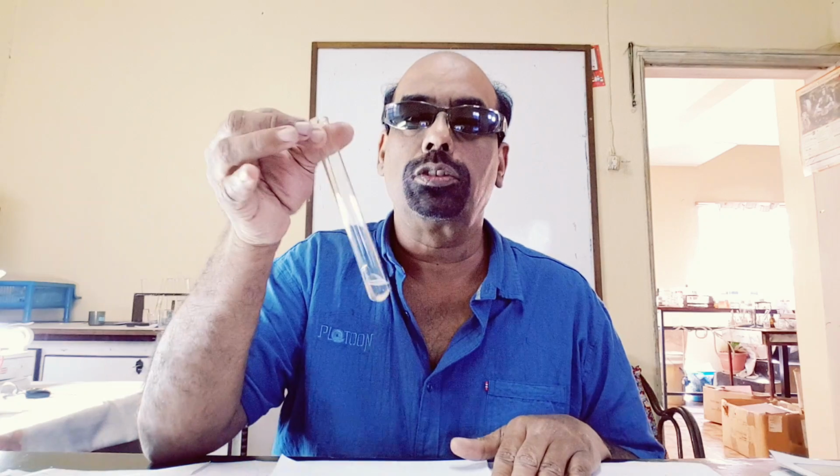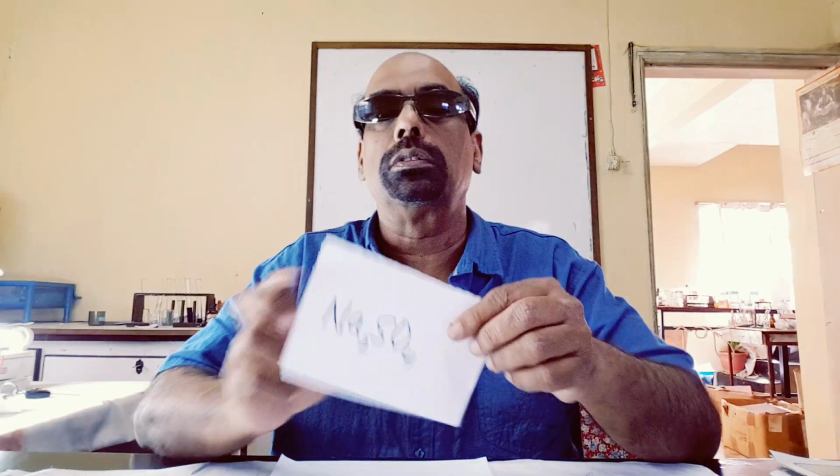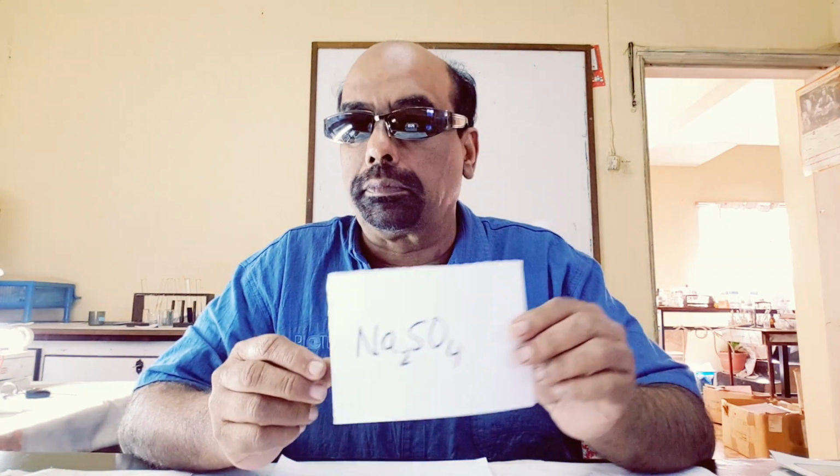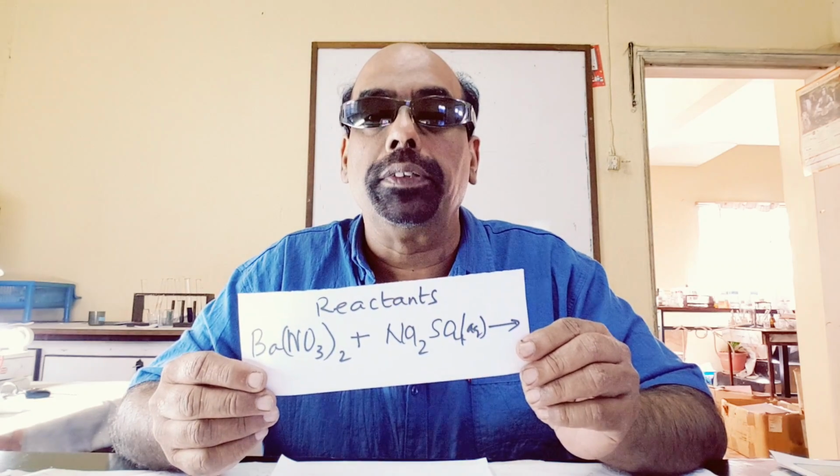If we take barium nitrate solution, and if we take sodium sulfate solution, Na2SO4 solution, we add these two solutions, the reactants barium nitrate and sodium sulfate.